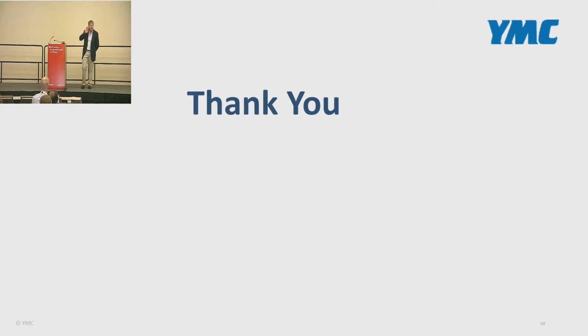I couldn't hear that one. Yeah, exactly. They've done this. Like I said, this isn't brand new things. Putting it all into one box, having the software to do it, and having the predictive wizards to take your initial batch run and develop the process, so you only have to do minor adjustments. That's where the new technique has really come in to give it the power.